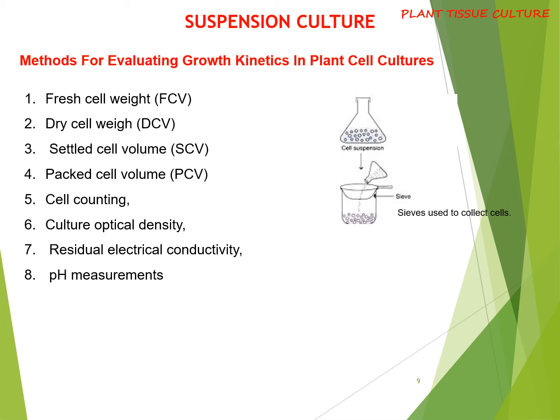To calculate the settled cell volume, a known volume of the suspension culture is allowed to sediment for 30 minutes in a graduated or a measuring cylinder.